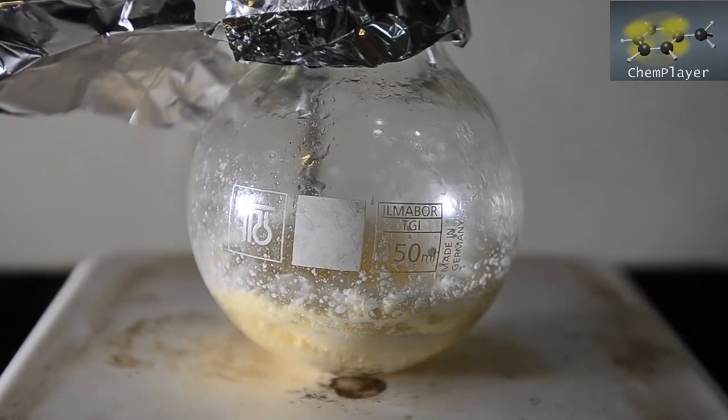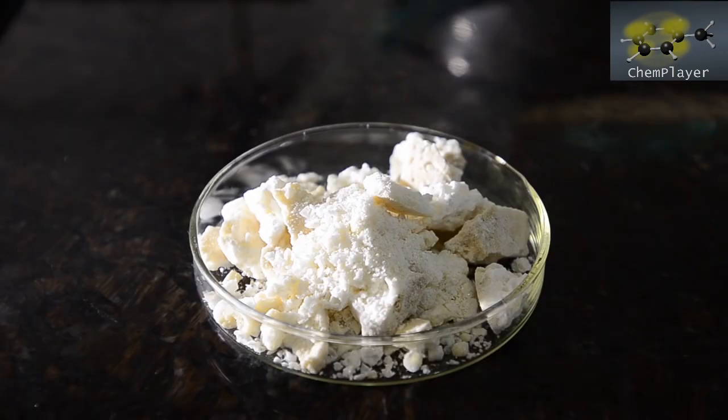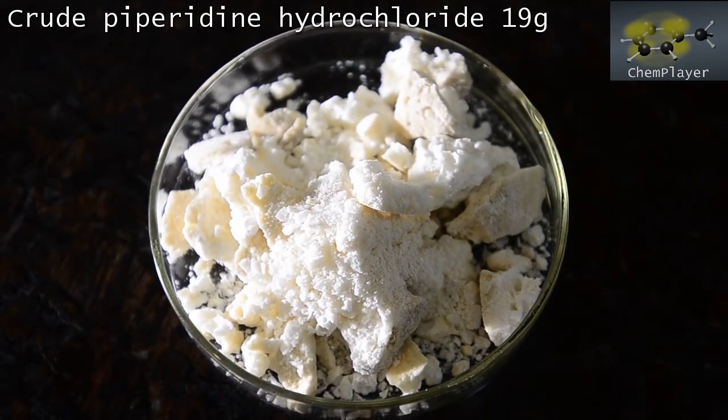Getting all the water off was a slow process and took over 2 hours to complete. But here's the result. A cake of what looks to be fairly dry solid in the flask. And here's our crude product. 19 grams of piperidine hydrochloride. This is greater than the theoretical amount that can be produced, so it's obviously still got some water in it, and maybe some sodium salt impurities.